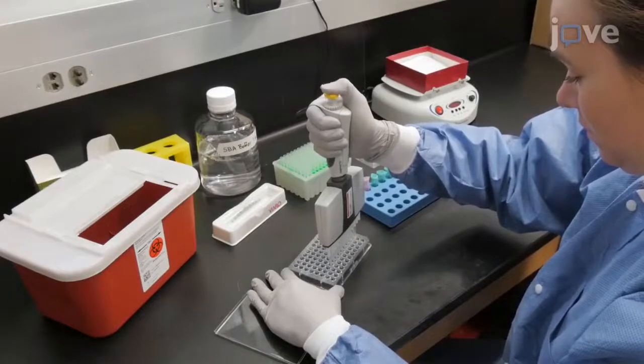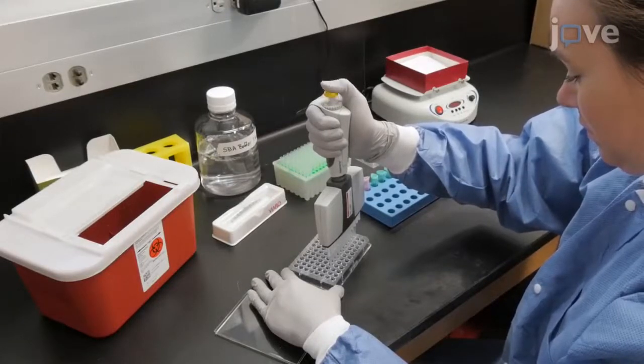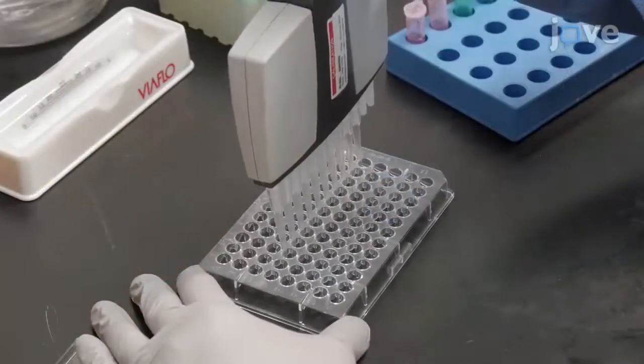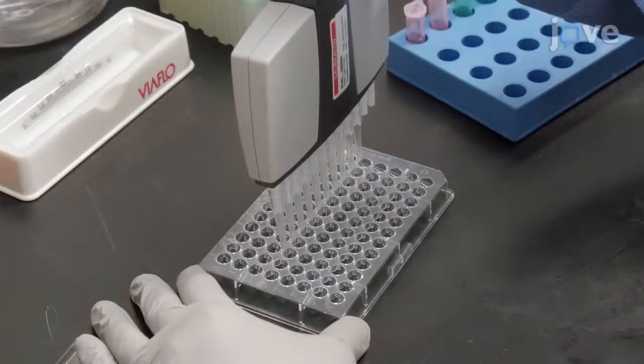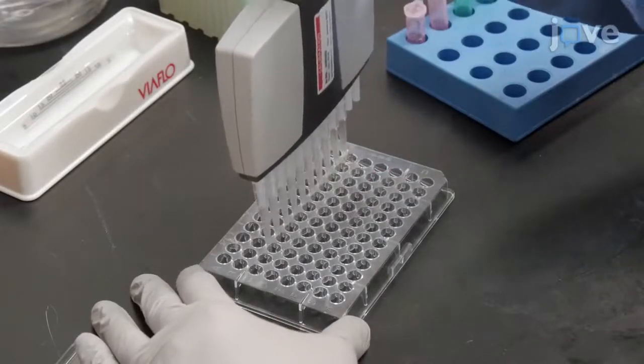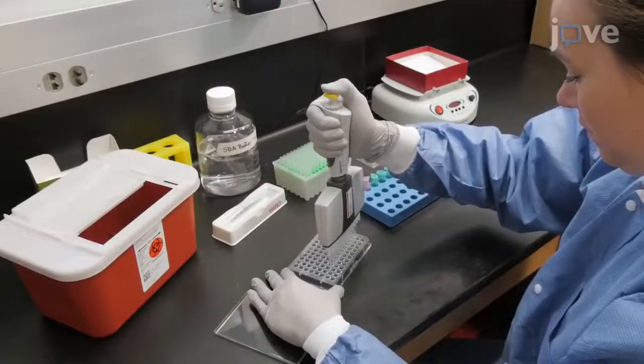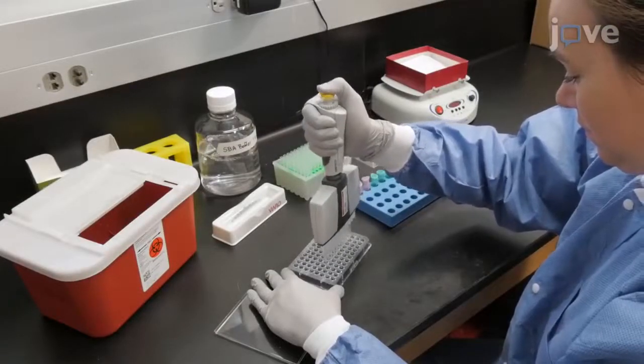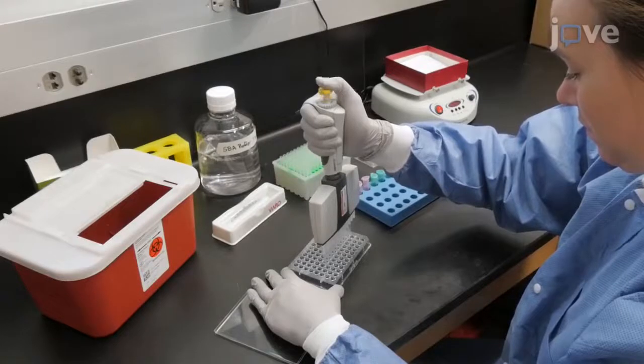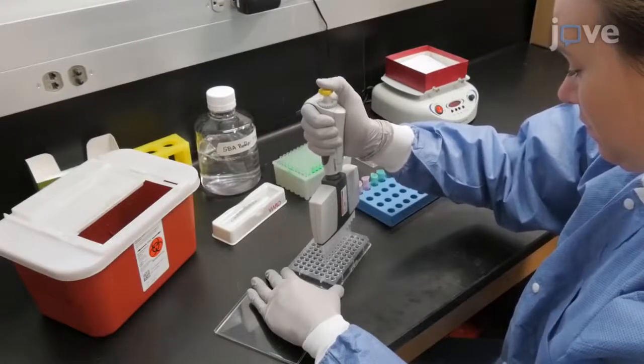Transfer the samples to the corresponding wells in row G and pipette up and down 8 to 10 times to mix the sample well. Then, remove 10 µL from these wells, transfer to the corresponding wells in row F, and pipette up and down 8 to 10 times to mix.